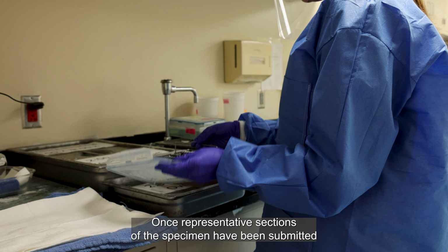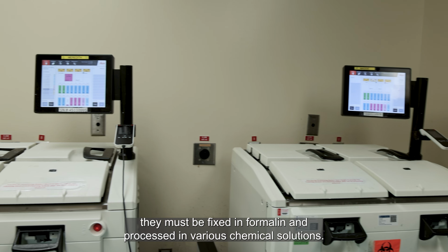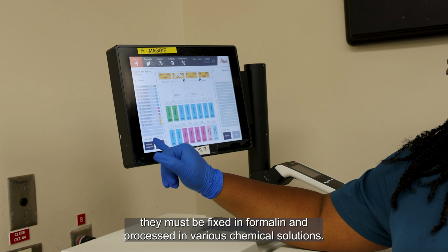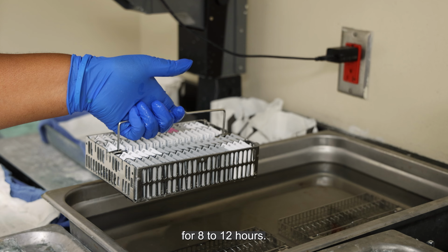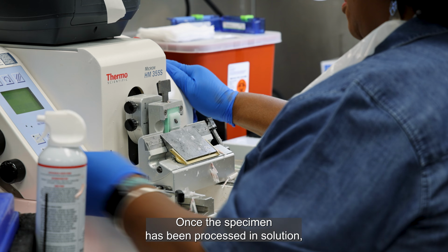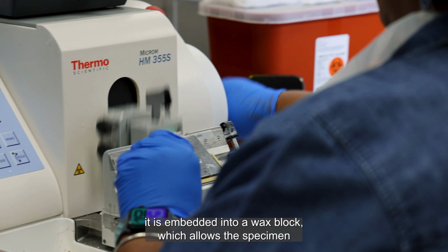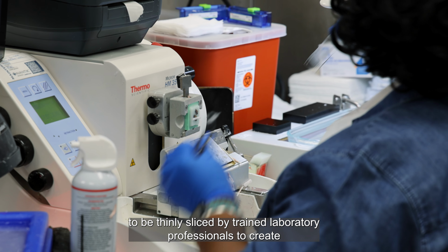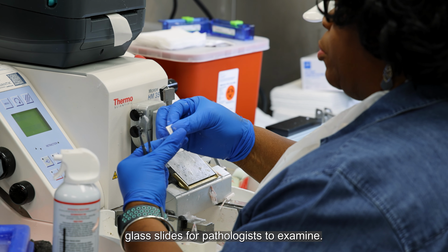Once representative sections of the specimen have been submitted into appropriate cassettes, they must be fixed in formalin and processed in various chemical solutions. Our uterus specimen will soak in these solutions for 8 to 12 hours. Once a specimen has been processed in solution, it is embedded into a wax block, which allows the specimen to be thinly sliced by trained laboratory professionals to create glass slides for pathologists to examine.